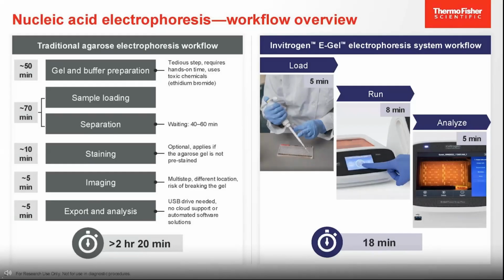On the other hand, we have some innovations within the electrophoresis field. This would be namely the Invitrogen E-Gel electrophoresis system. And once you have prepared your sample, it's basically 3 very simple steps. You load the sample, you run the sample, and you analyze it all on one instrument without the need of preparation of all the buffers and the gels. And it just simplifies it to a process that takes about 18 minutes.